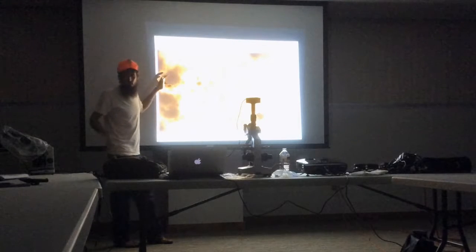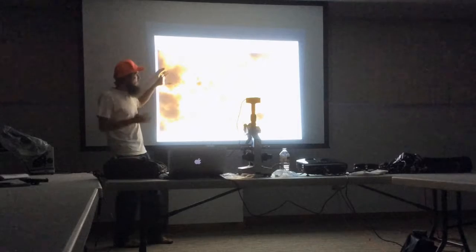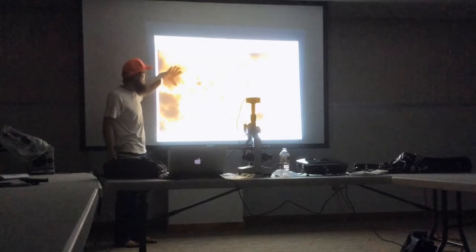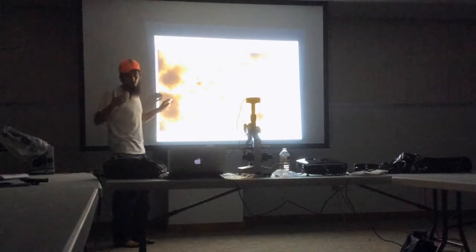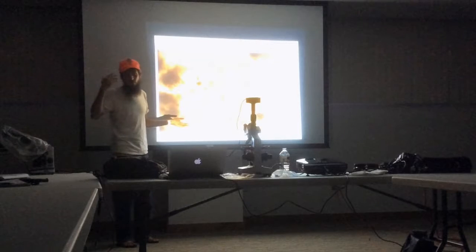If you need to count bacteria, for some reason, which I don't do, you would have to dilute this more to break these aggregates up. This is probably, I don't know, thousands of them. I can't make a good estimate on that. And that's one of the reasons when I'm doing my soil analysis, I largely ignore the bacteria.